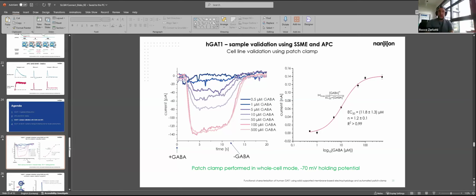This is also why we can detect these different phases in the current. If your temporal resolution is not high enough, you tend to see a current that is a sum of everything. While if the temporal resolution is high enough, then you can actually resolve the different contributions.